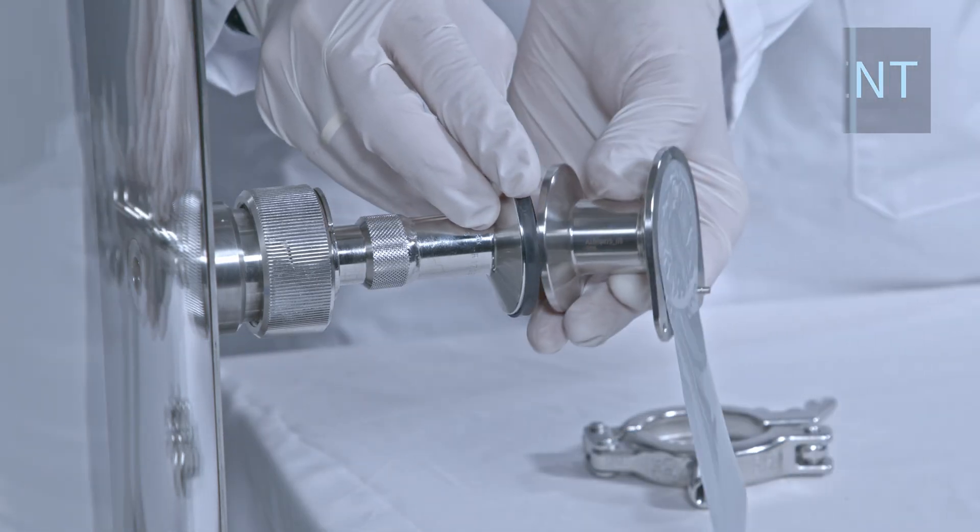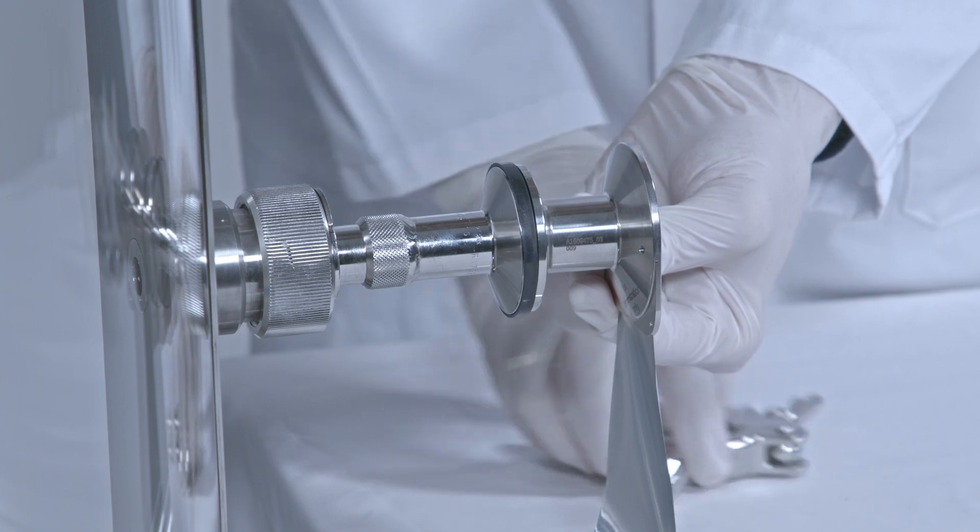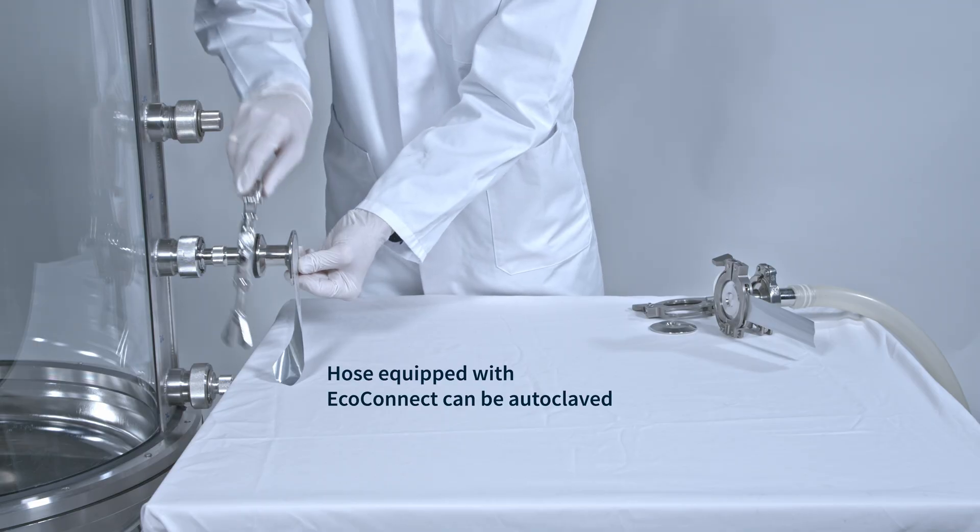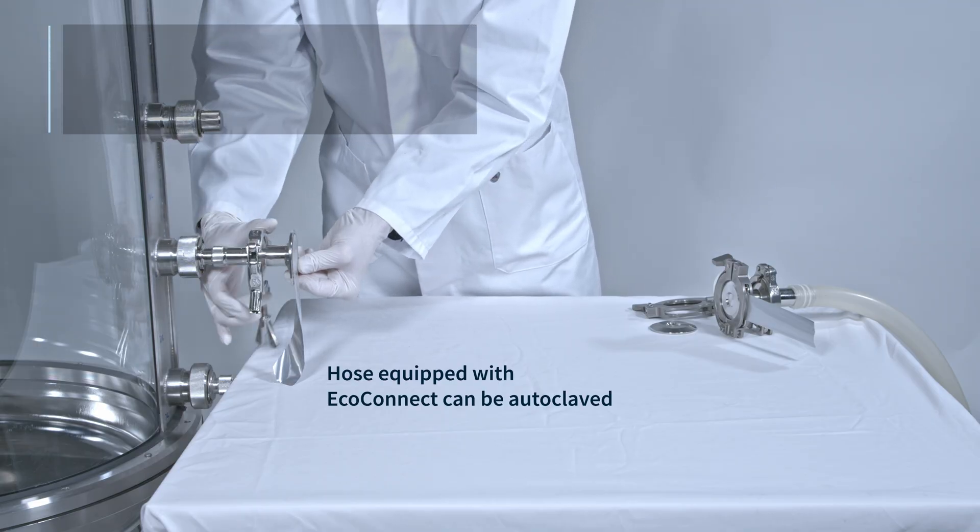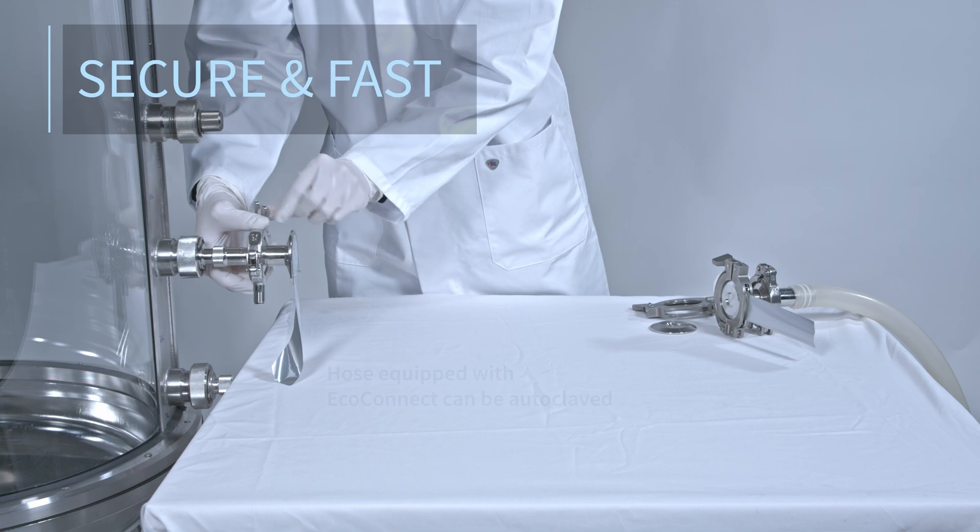Zeta EcoConnect integrates seamlessly with both stainless steel and single-use systems, designed for ultimate convenience, capable of being steamed, autoclaved and gamma sterilized.